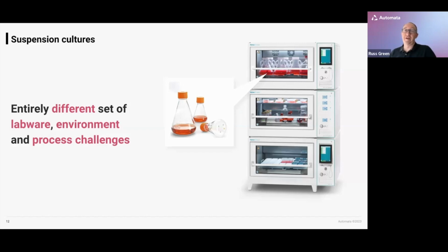So separating my cells from my media in a suspension environment is actually far harder than with adherent cells because the adherent cells are already stuck down. So I need to think about all those extra process steps, such as centrifugation, that I need to incorporate into that. I will come back to this a little bit, but it's not something I'm going to go super deep on today.